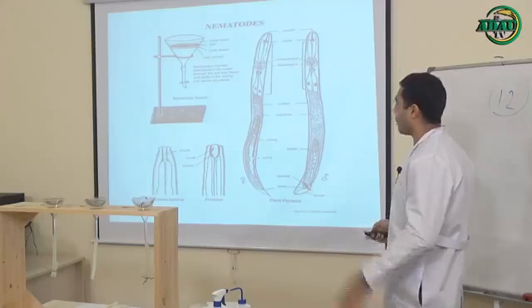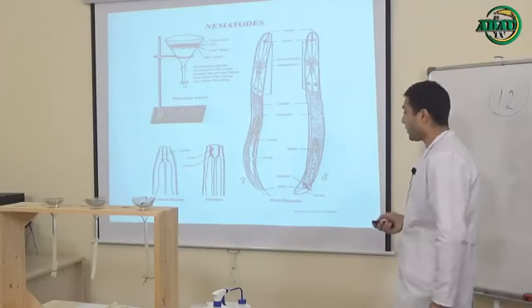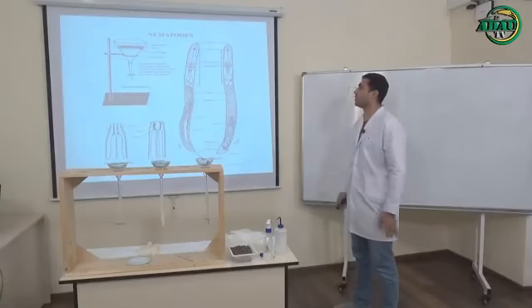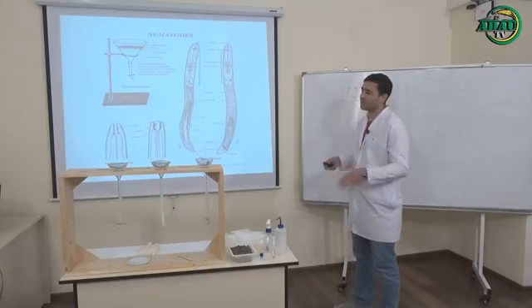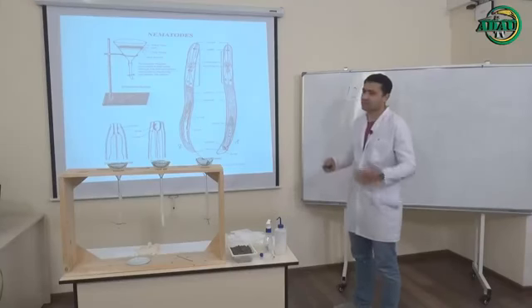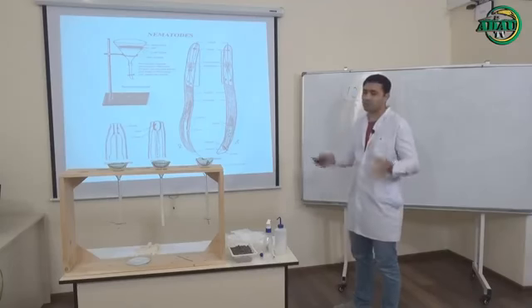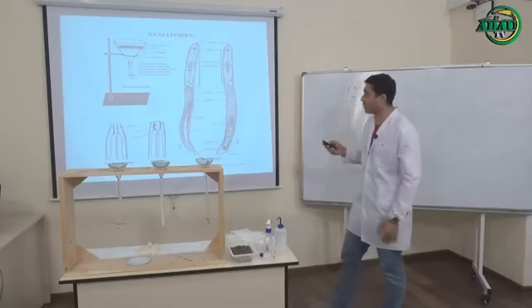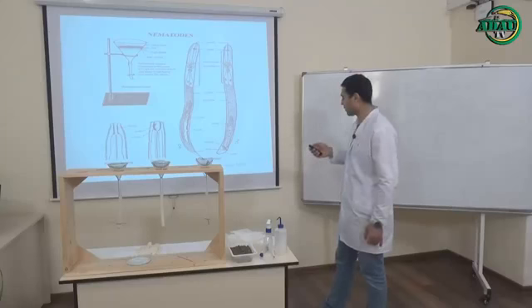And after that, we can see a lot of nematodes, and we have to know which ones are pathogens for plants and which ones are non-pathogens. Actually, most people and most laboratory workers mix all of them up. They see a lot of nematodes and want to tell us, okay, we found nematodes, all of them are dangerous for our plants, but it's not true. We have to take care about some points, which I am going to show you right now.